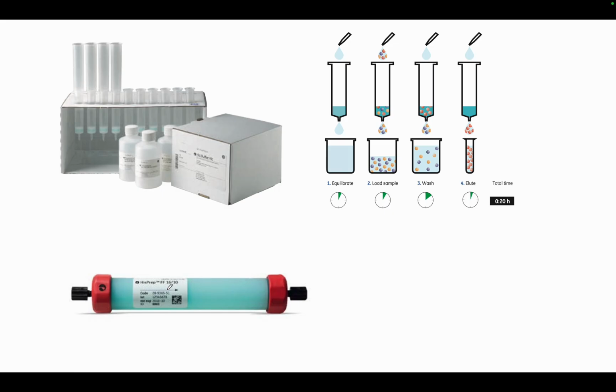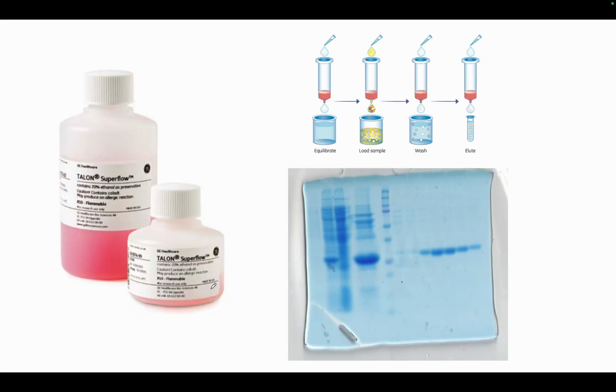It looks blue. And you can connect this to your purification unit the same as you would connect an SEC column or an ion exchange column, and use it for affinity chromatography. Like I mentioned, that was a nickel resin. This was a cobalt resin. It's cobalt NTA, called Talon.